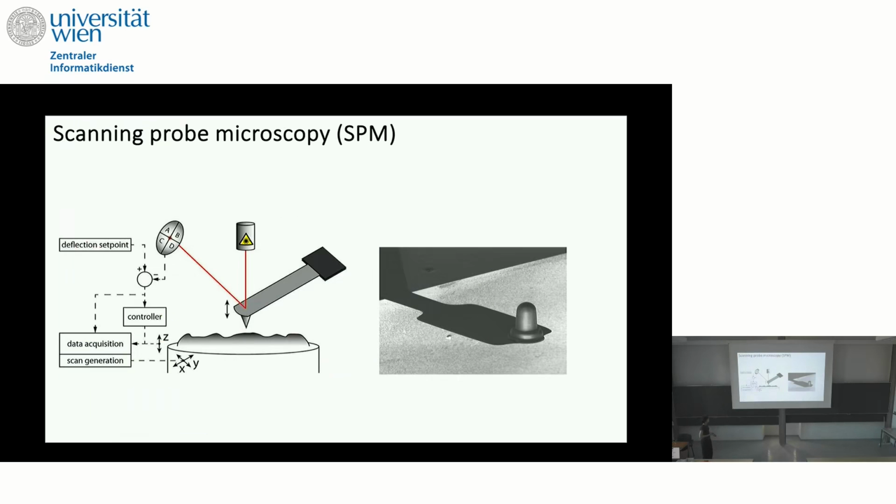And this is actually scanning probe microscopy, or you might know it as atomic force microscopy. I put this picture here just to remind you that it's the same methodology, just the lateral resolution is a bit different between AFM and SPM. So it's a probe-based method. You have here the cantilever, you have the probe, and you have a laser light focused on the cantilever going to a photodiode.